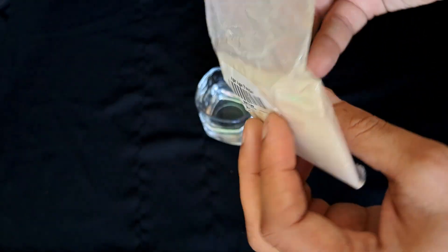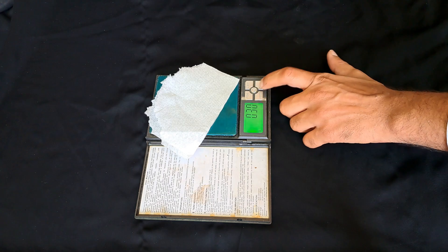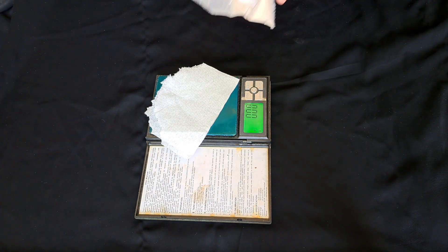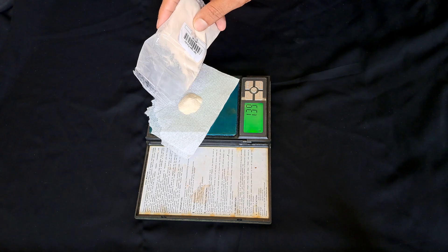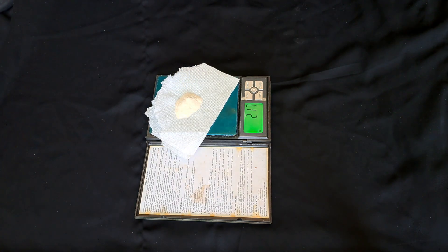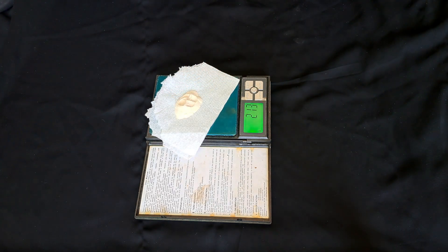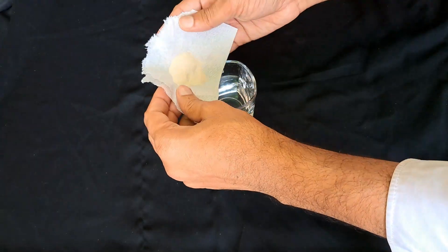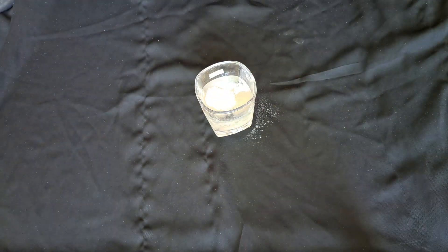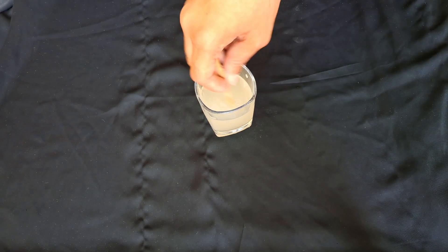First, I have taken agar powder. It needs around 3 grams to dissolve in 50 ml of water. As we are going to make 2 plates, 25 ml for each. It must be dissolved properly.